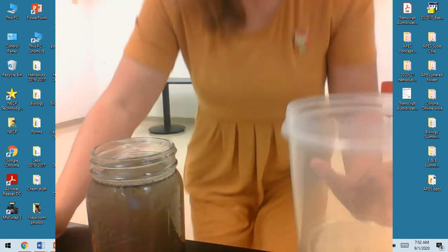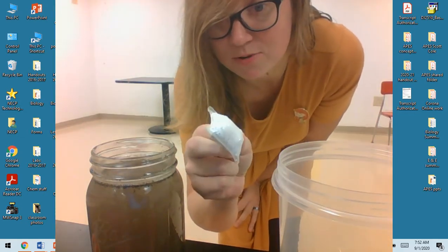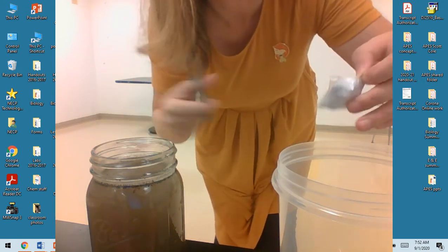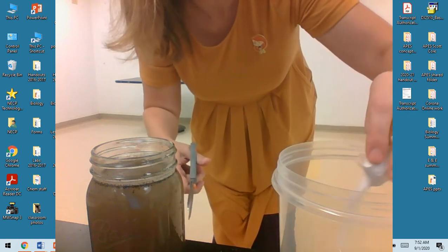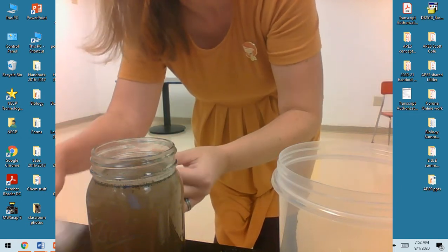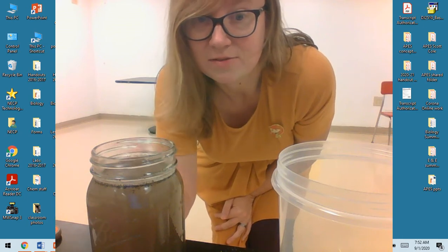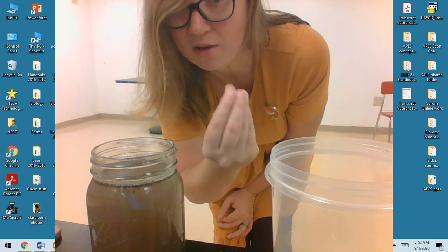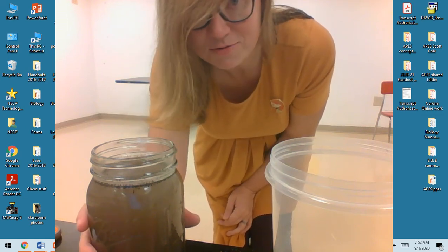Oh, don't forget. When I shake it, I'm going to add about a teaspoon of this powdered dish detergent. So you know that it's really happening, I'm going to add some of that right to this bucket. Oh yeah, that's more than a teaspoon. More than enough. Oh, don't touch it with wet fingers. Okay, so I'm going to add this into here with my powdered detergent. It acts as a surfactant to break up the particles from each other, so you can see more of that settling. That's what we'll see tomorrow.